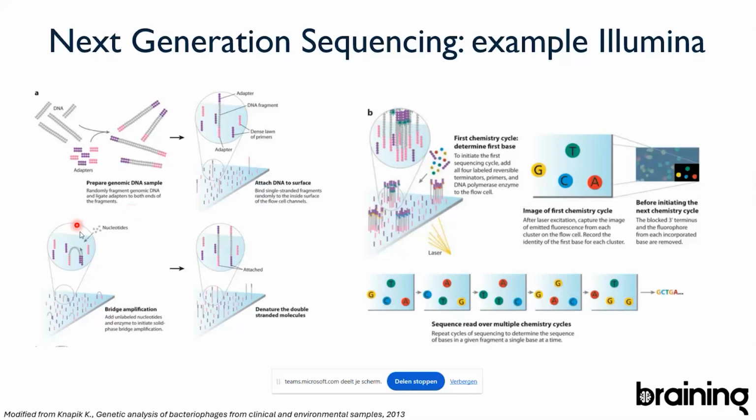So before you start, in a chemical, enzymatic, or physical way, you make your DNA into small parts of 300, 400, 500 base pairs, so that you can put them in the machine and so that the reaction is efficient, right?